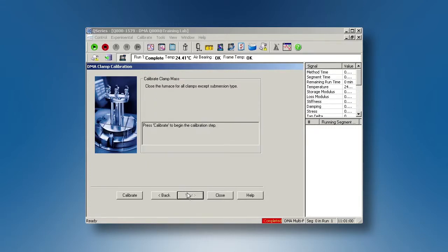close the furnace from the instrument touchscreen, then click on calibrate.